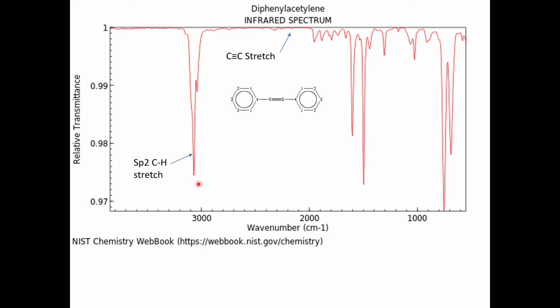Something very important to note is that we have a carbon-carbon triple bond, and normally these can be seen on the IR spectrum when they are polarized. When we have a carbon-carbon triple bond in the middle of our molecule, such as so, we actually do not get a signal at all. Normally there would be a very sharp peak here around the 2100 mark.